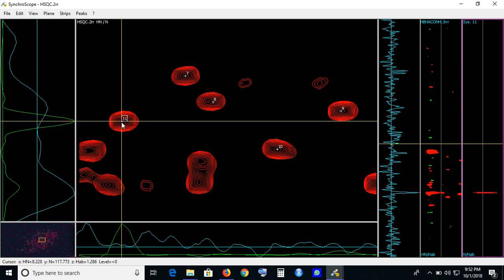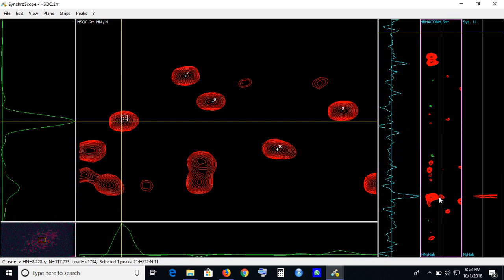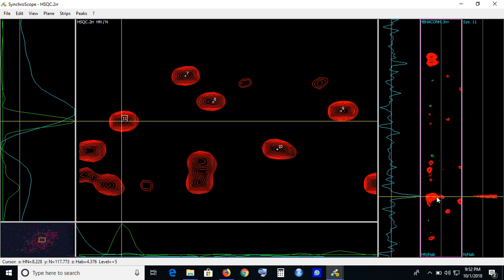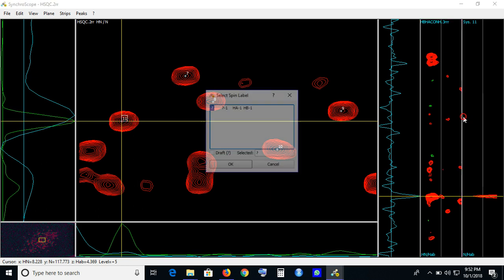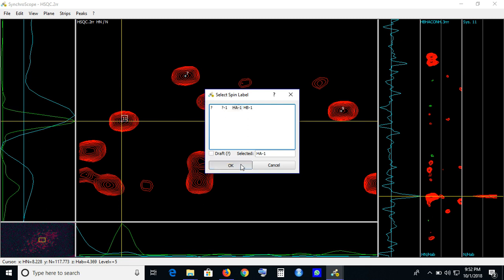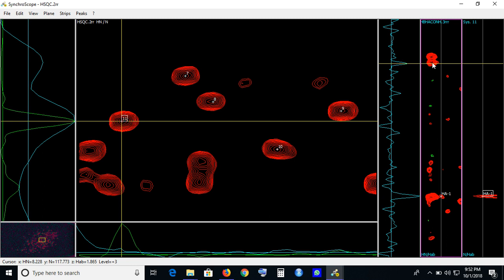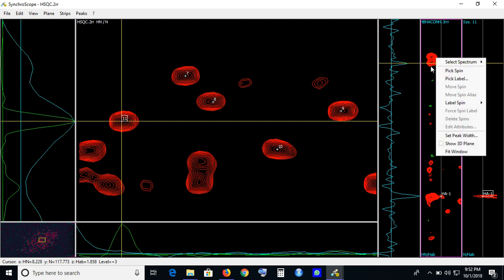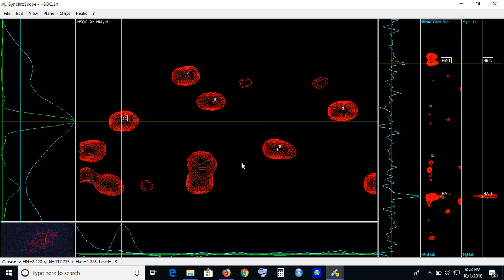Okay, now you have this particular peak level. So now we have to select the peaks for this. By chemical shift, you know that this particular value 4.369 is HA value. HB comes a little lower, like 1.86, that range. So peak level HB, this one. Okay, now you can see that.